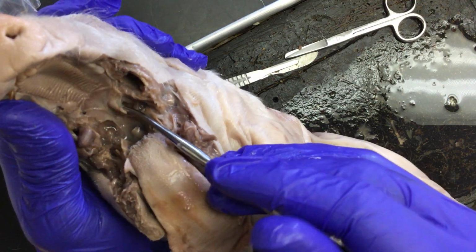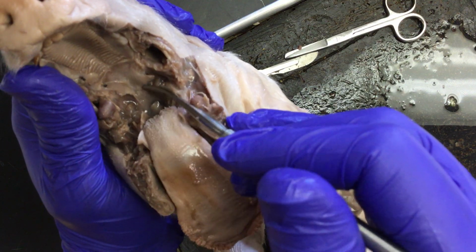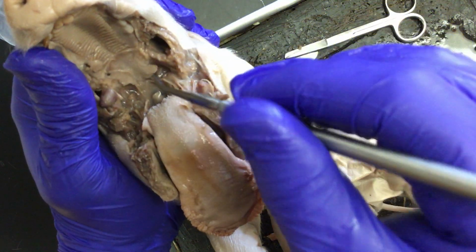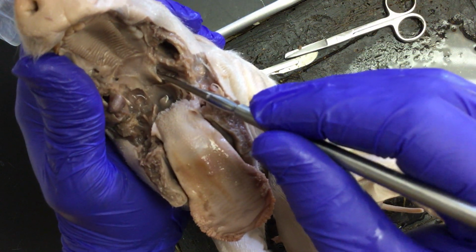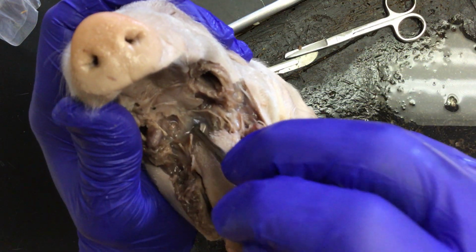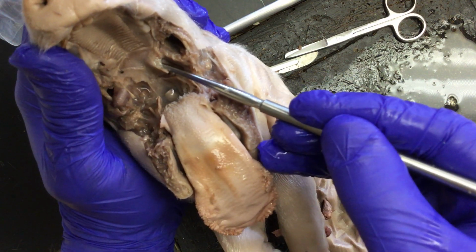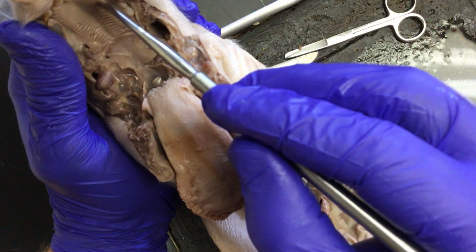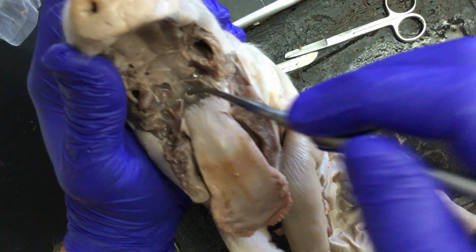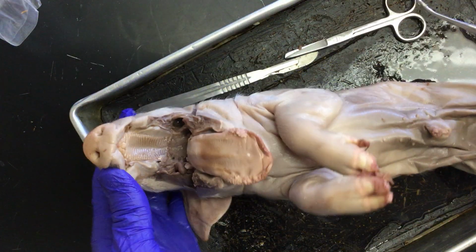And if we look back this way, this opening right here is called the nasopharyngeal opening. This is where air from the nose comes down into the mouth, just like when you breathe in. It passes through your mouth in order to enter the trachea, in order to enter the pig's lungs. So just back up in here, these tubes have now closed off, but it follows just behind the hard palate and then exits here in order to dump into the pig's lungs. So there's our pig and the oral cavity of our pig.